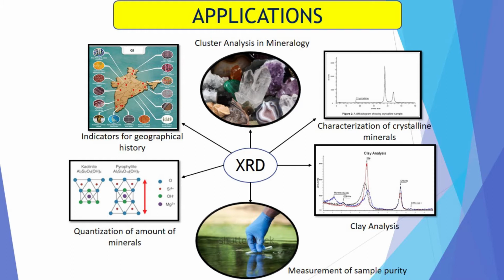So, characterization of crystalline minerals and clay analysis, such as montmorillonite, chlorites and kaolinites, can easily be done through XRD. Quantification of the amount of minerals can also be done, and finally, XRD can be helpful as an indicator of geological history.